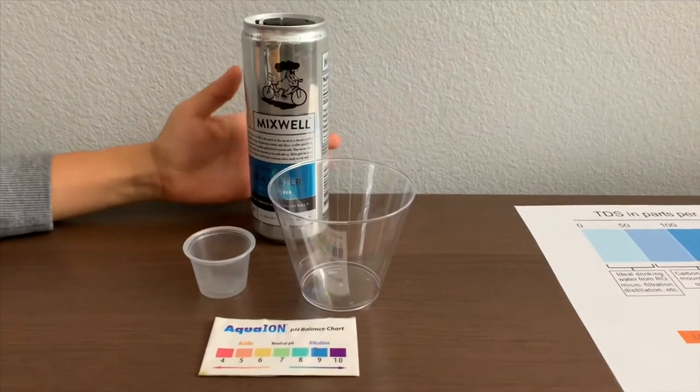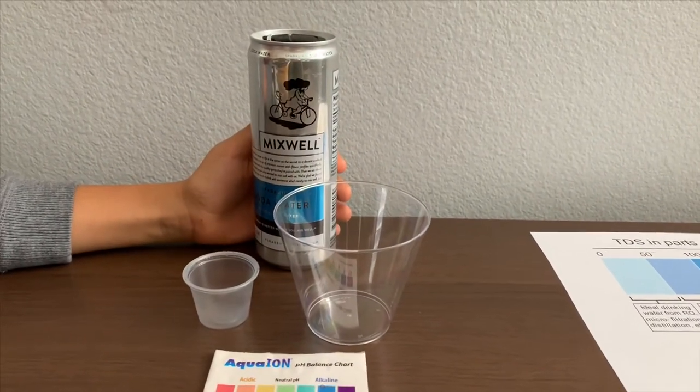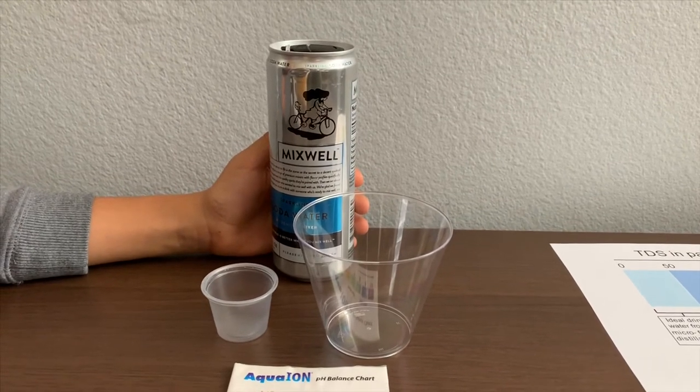This is Mixed Well sparkling soda water. It's carbonated water sourced from California. You can buy it from Target.